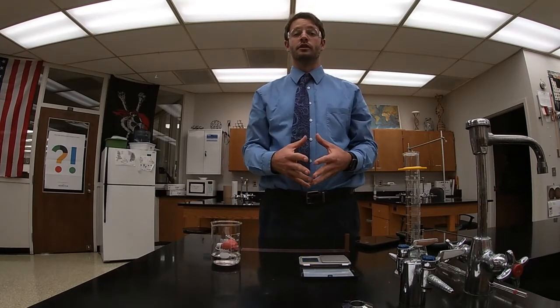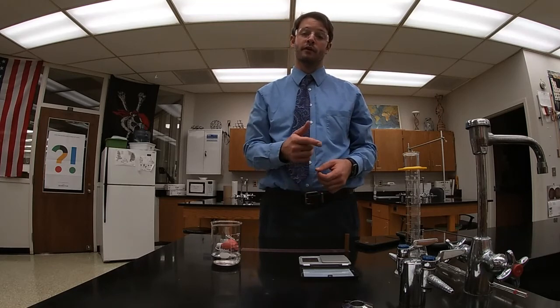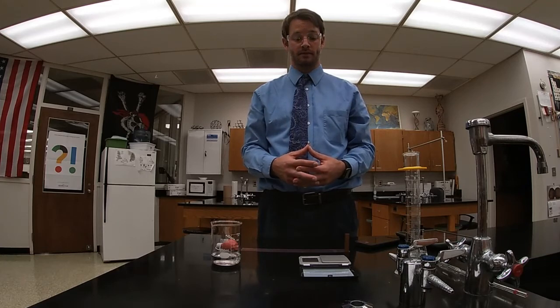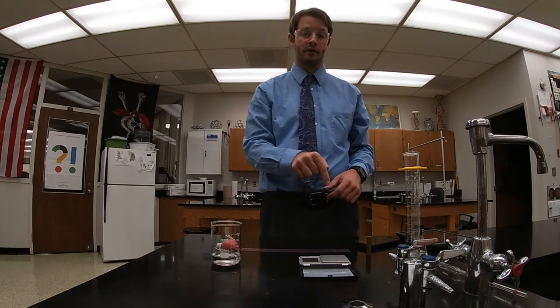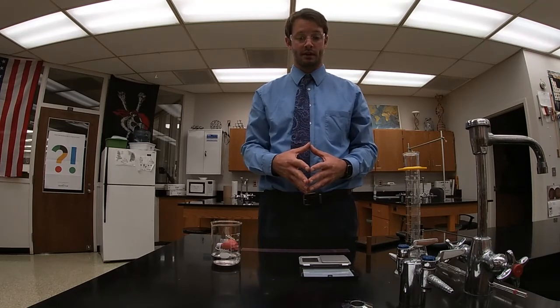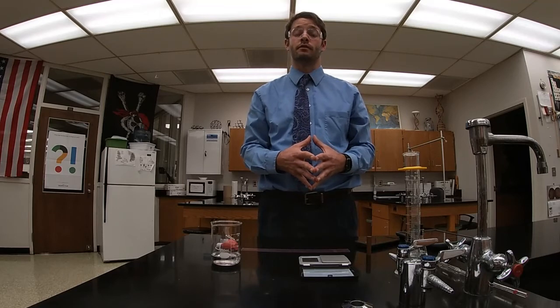You could then use the equation V, volume, is equal to pi times the radius squared times the height to determine the volume of the cylinder in cubic centimeters. So if I have the mass and I have the volume, I can calculate the density. I'm going to also calculate the density in a different method.